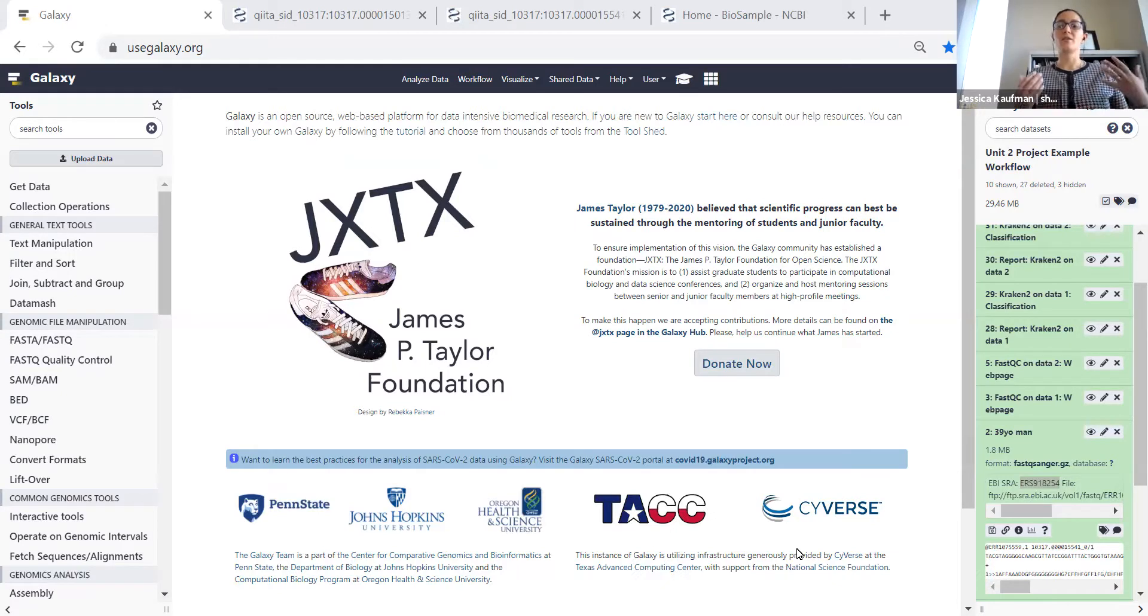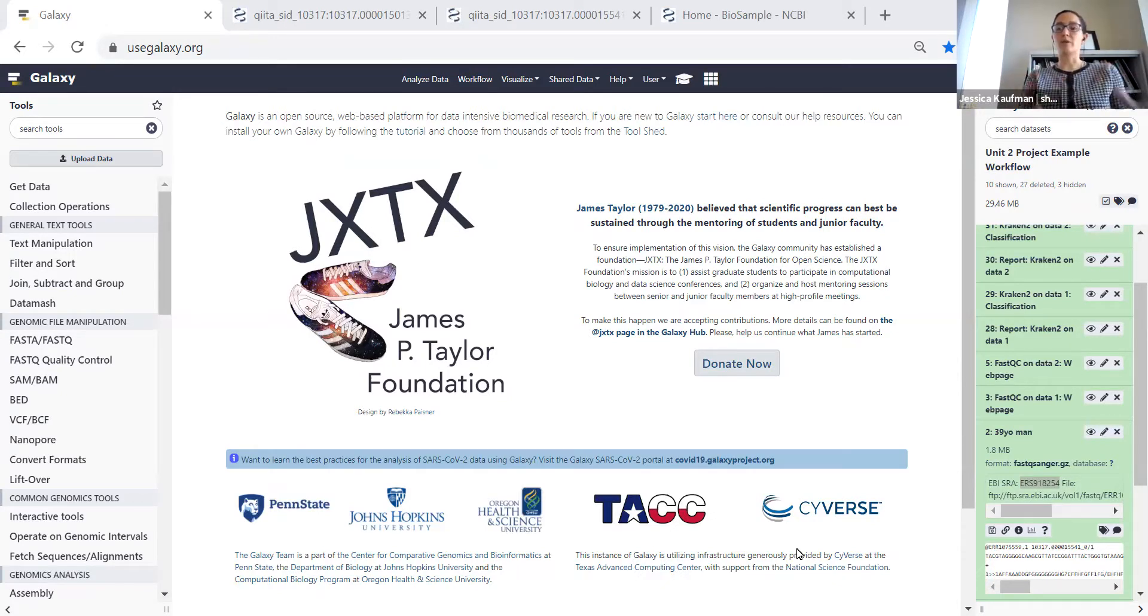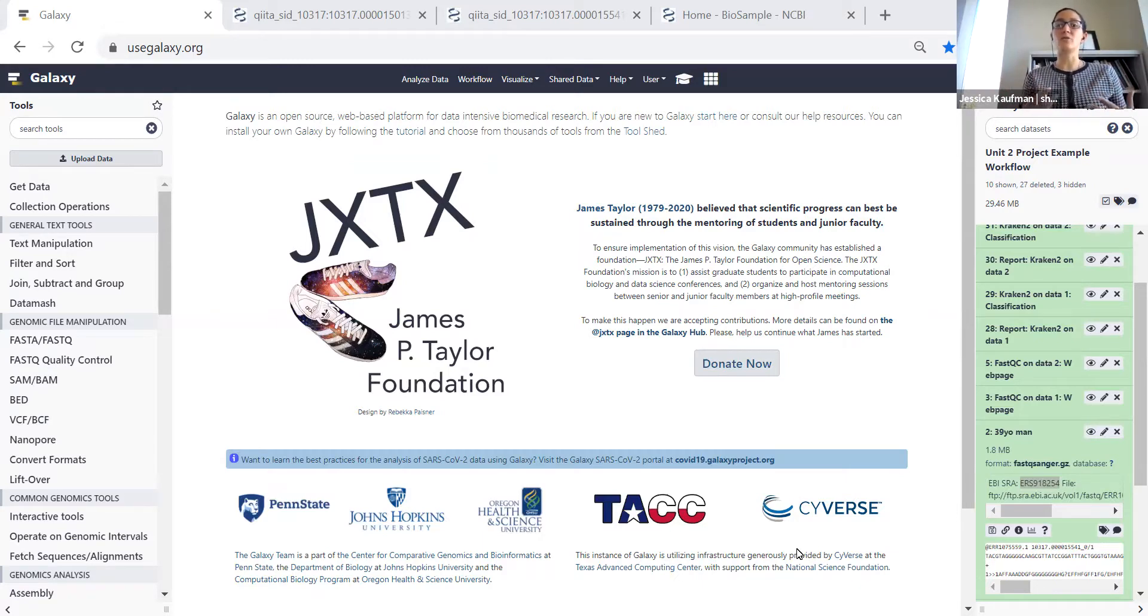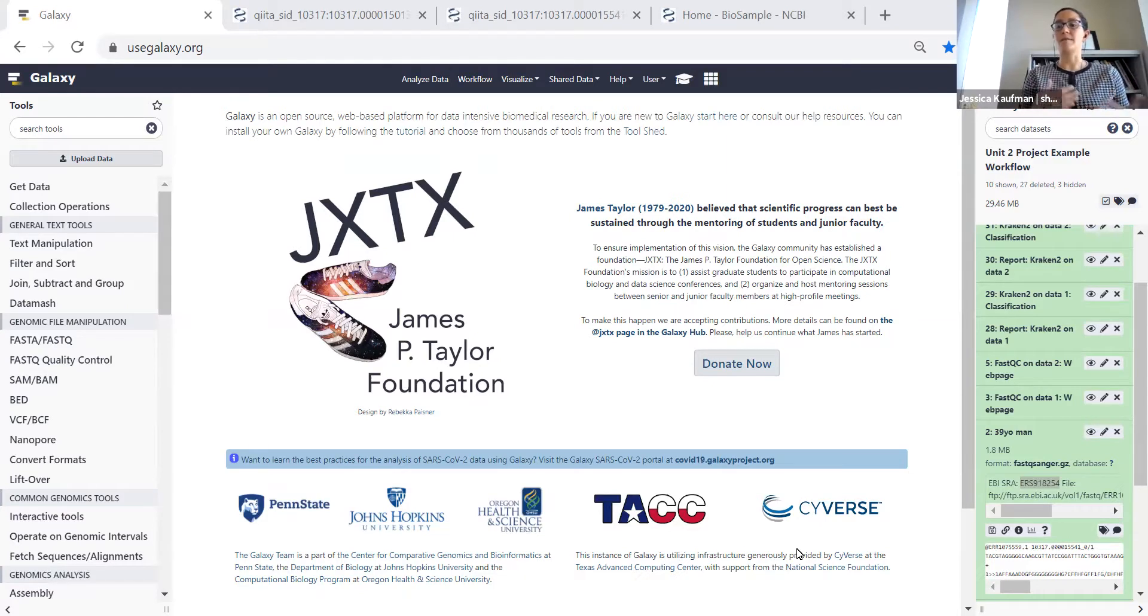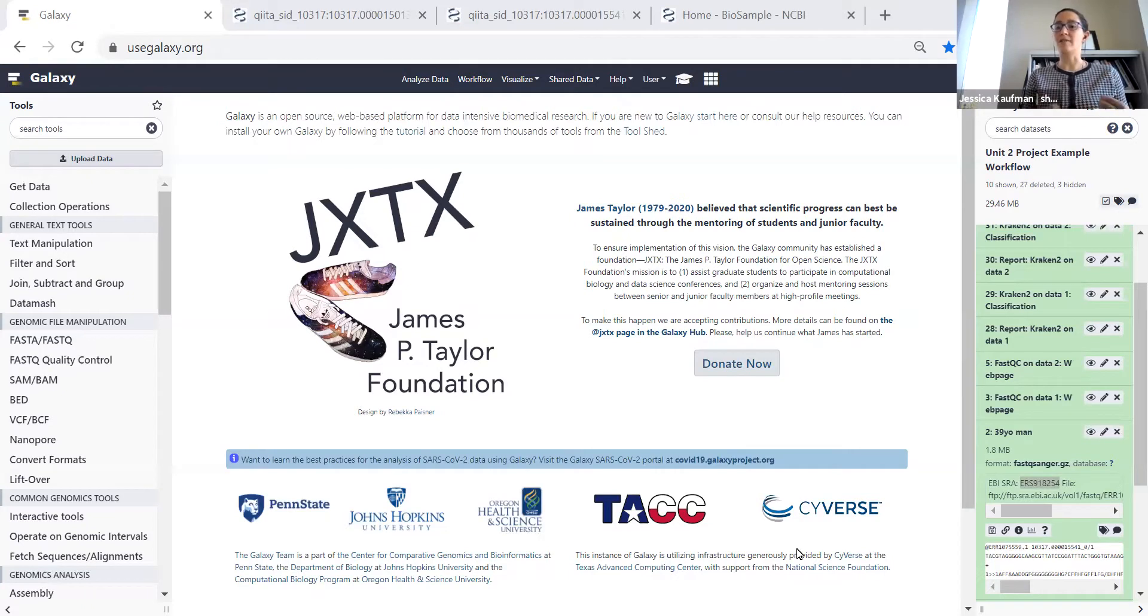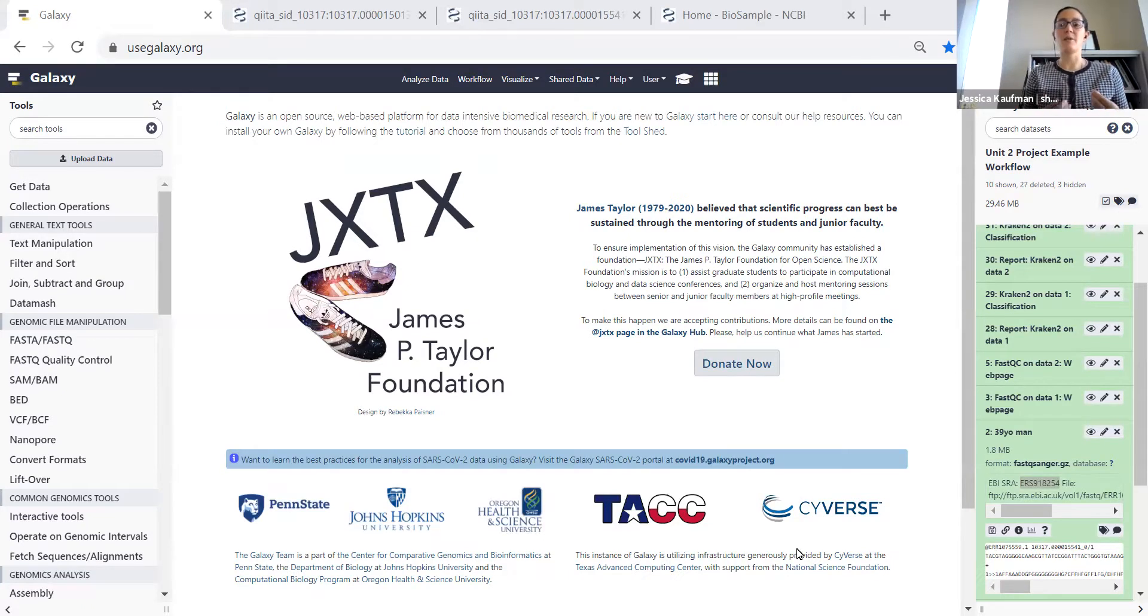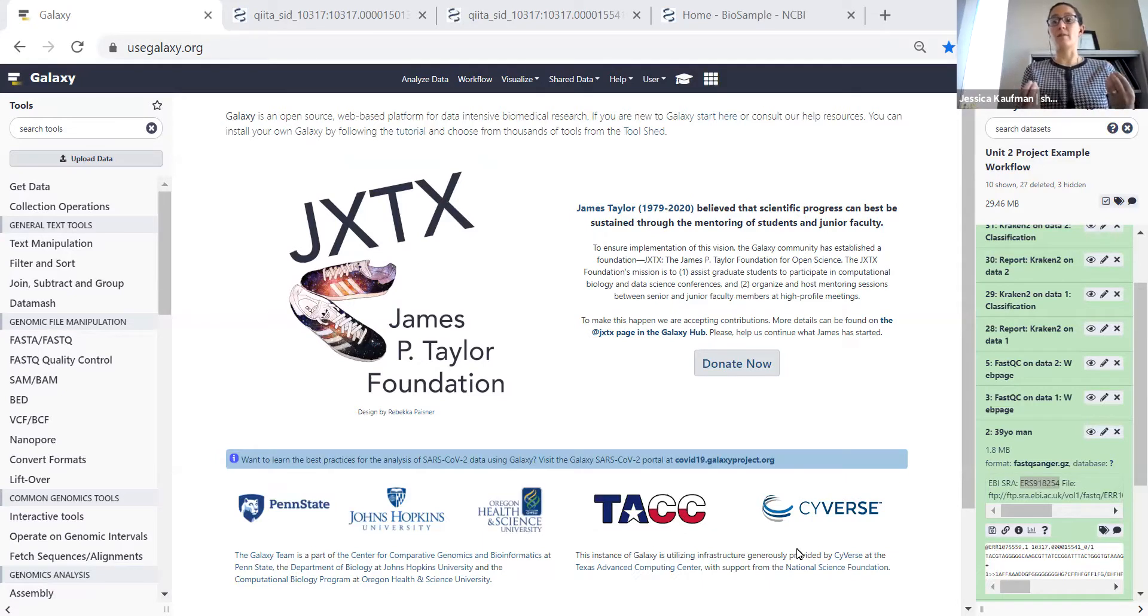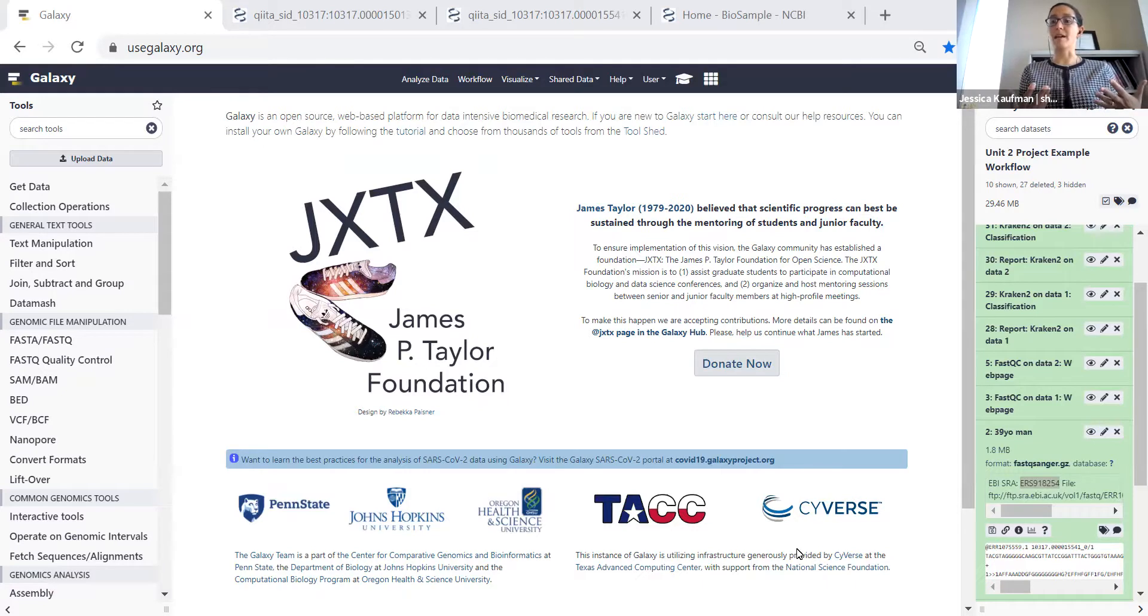The first thing we're going to do to create this Unit 2 project workflow is start on the database that stores biosamples. This database allows you to search for samples taken under specific conditions and will enable us to find two microbiome samples, FASTQ files from two microbiome samples, that we can compare for the Unit 2 project.